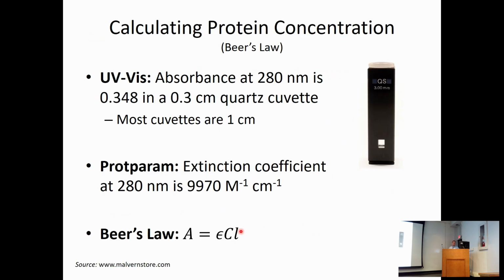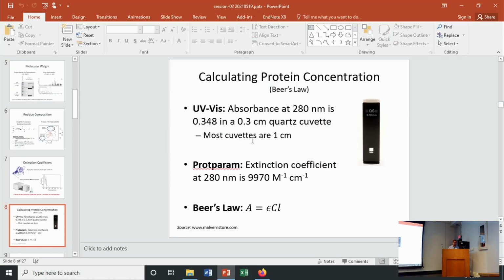Okay, so I think that's a good point for us to go into ProtParam and start looking at this and sort of seeing what it looks like, right? And so hopefully this switches over nicely. Looks like it did.